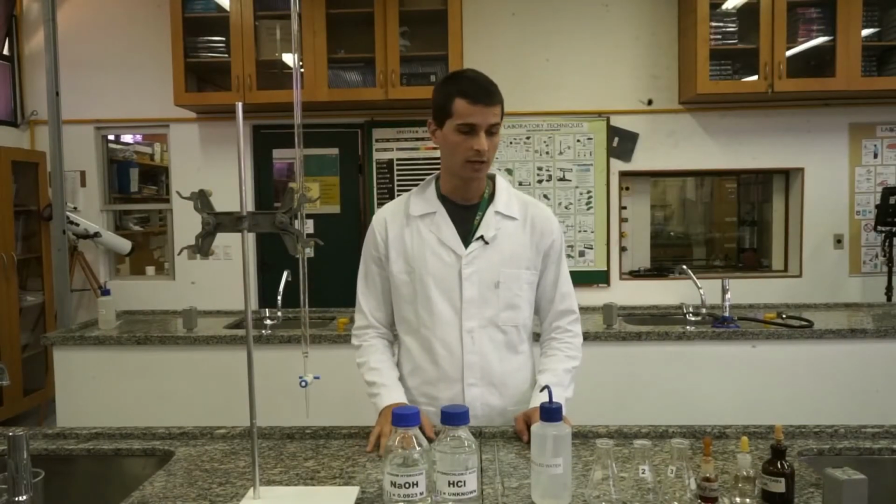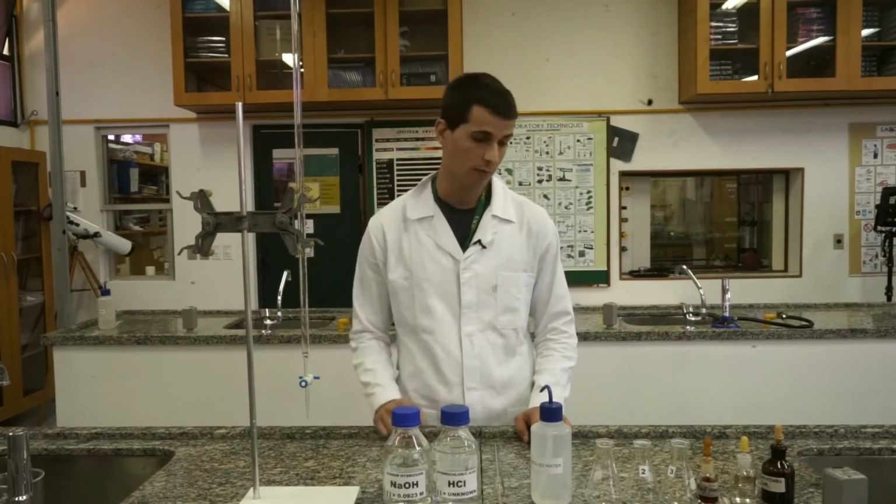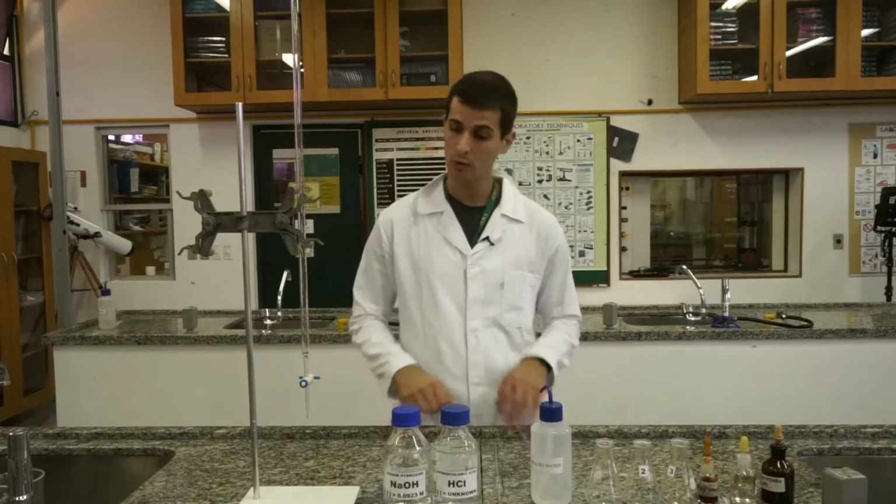So, to get started, I want to make sure I have assembled my titration apparatus, and I will take the opportunity to show the materials that we will use in this experiment.